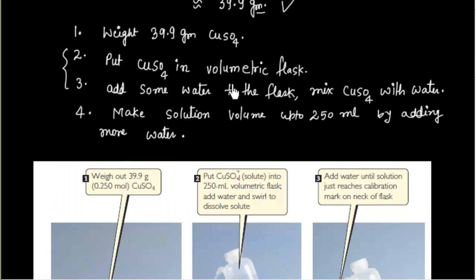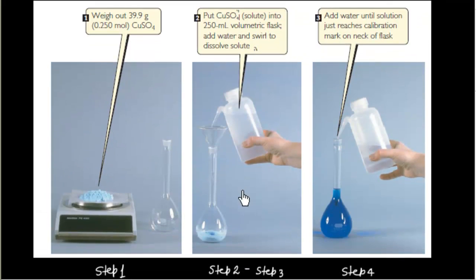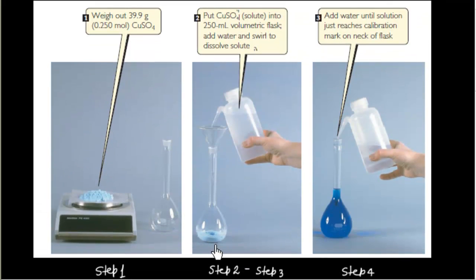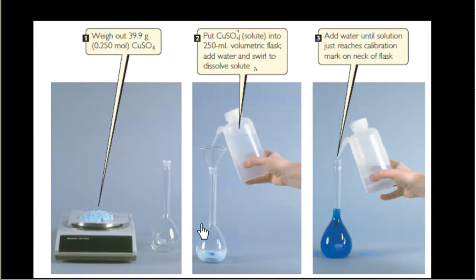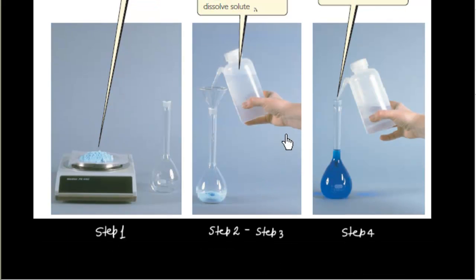That is step 2 and step 3, that is put CuSO4 into the volumetric flask. So we have added CuSO4 into the volumetric flask and then add some water. So we have added some water, mix them carefully. And finally we have to add water so that the final volume is 250ml. So this time this reading is basically 250ml. So final reading that is graduated scale.